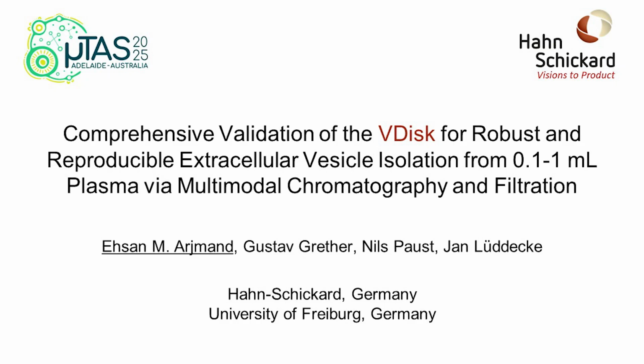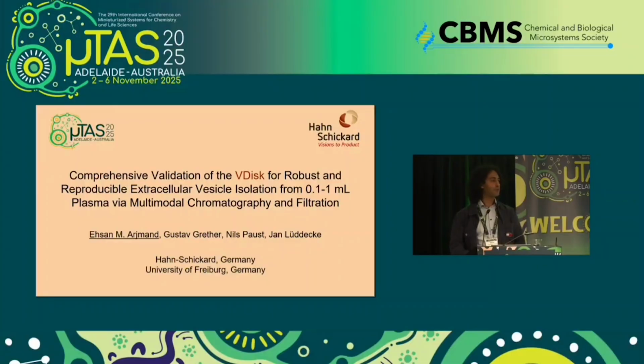Good morning, everyone. I'm really pleased to be here today, and as you probably understood from the title of the presentation, VDisk is a microfluidic platform for isolating extracellular vesicles from human plasma samples. This is something I'm developing during my PhD at Hahn-Schickard Institute and the Department of Microsystems Engineering at the University of Freiburg.